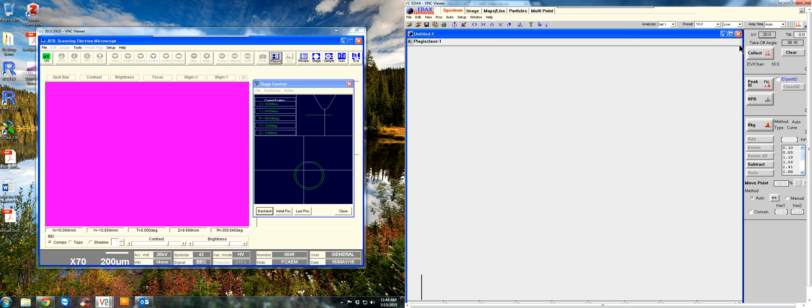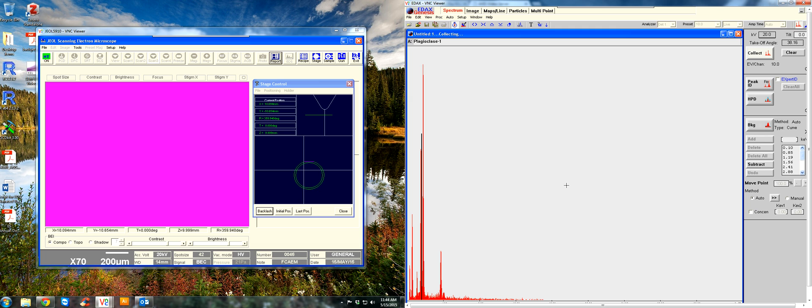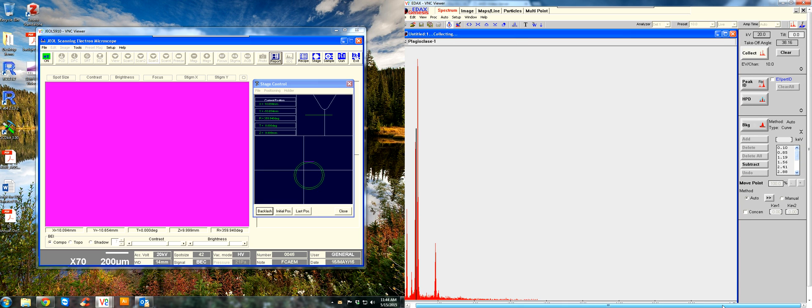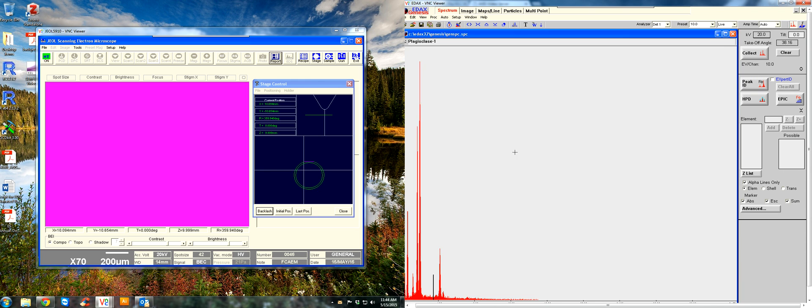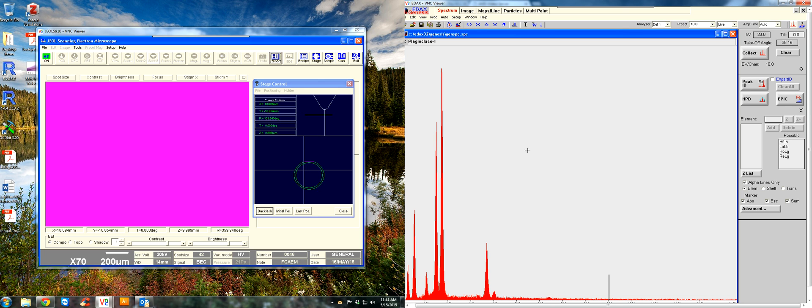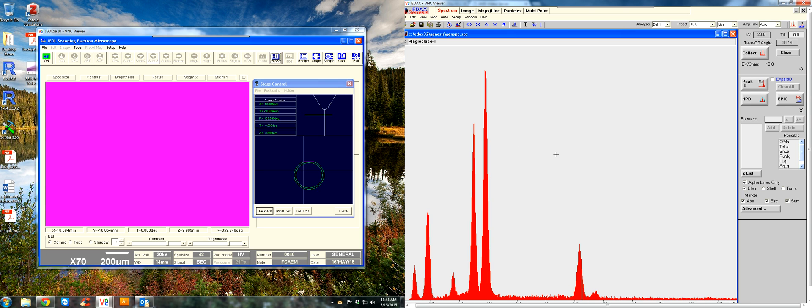And then you go over here to the right and hit collect, so it's going to collect the spectrum for 10 live seconds. It's pretty much got the same controls as the image tab, except we can expand on a few. The automatic peak ID did a pretty good job, so we'll just use that again.